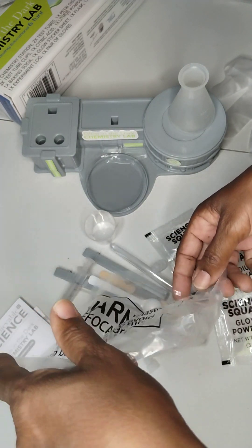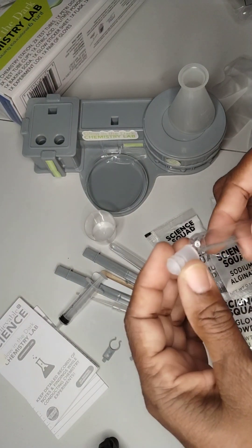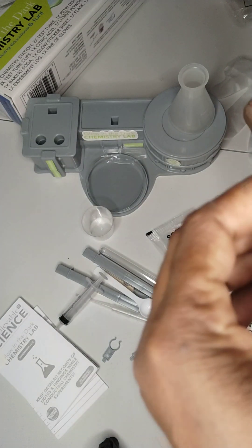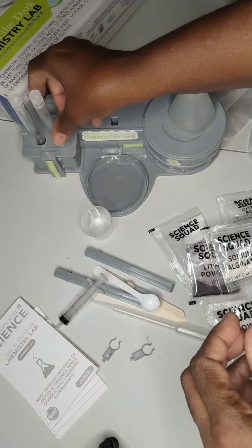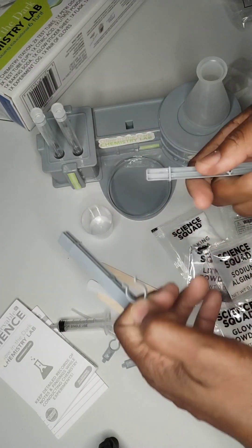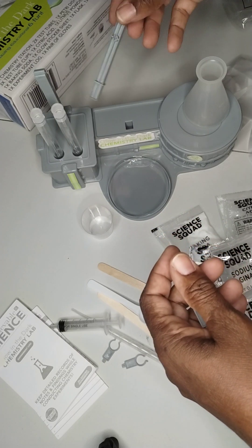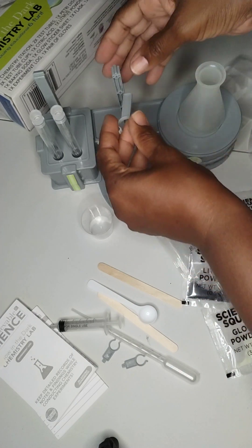Wee! Oh, this is out. I think this is pretty cool, like for kids who like science. So you have your pincer — your little things for your test tubes. I guess these are for your test tubes. They're all in there. These are pretty cool. I used to love doing these little science kits with my mom. So one of these — I think this is the big one. I think this goes in this way, and then this way goes this way. And then you have this little pincer there.